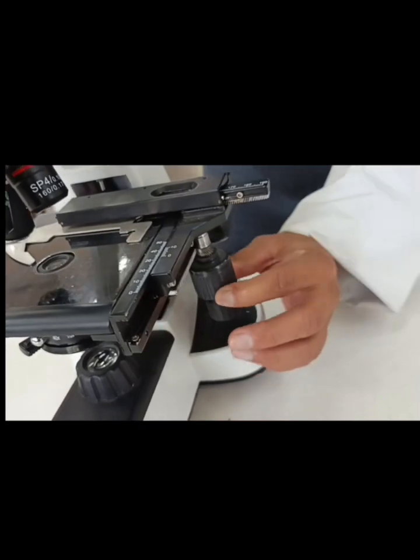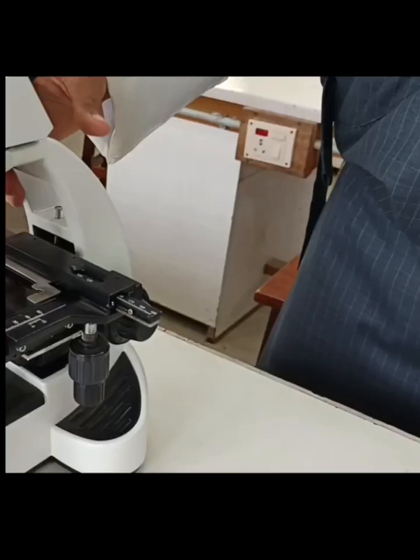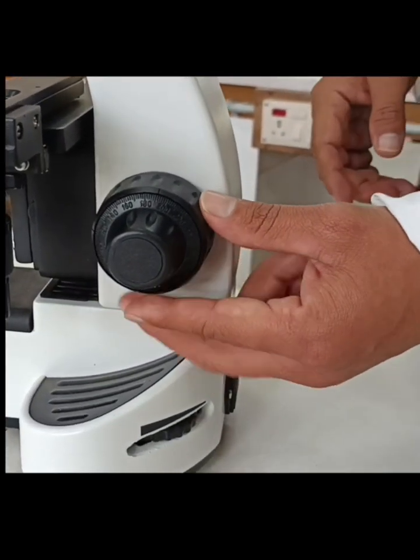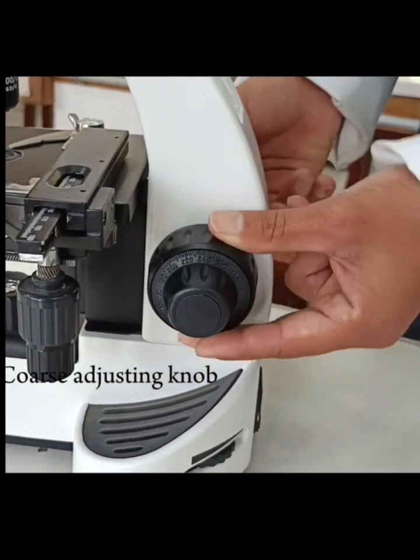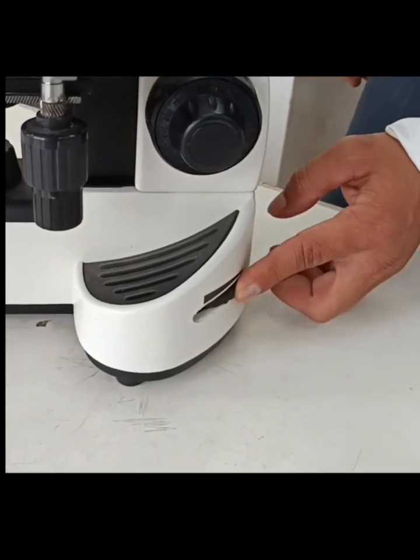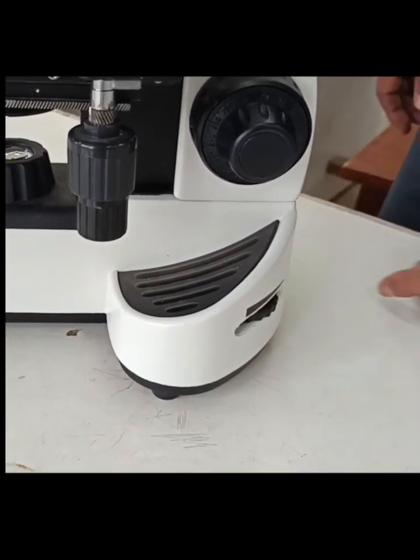And these two are the stage control. This is the arm, and this arm is connected with two adjusting knobs. This one is coarse adjusting knob, and this small one is fine adjusting knob. So this is the controller which controls the intensity of light in the illuminator.